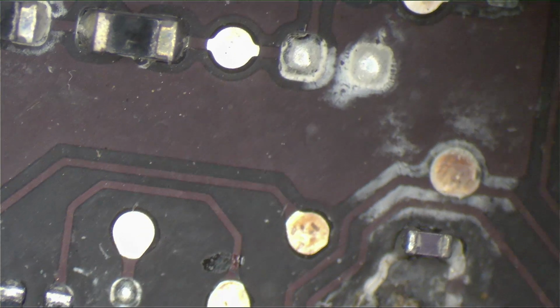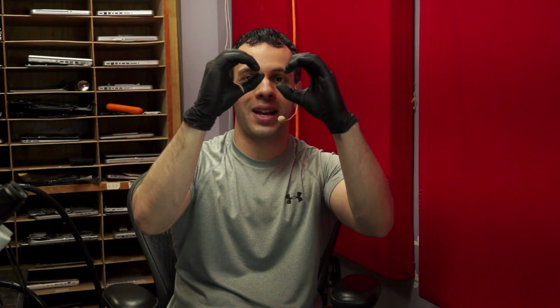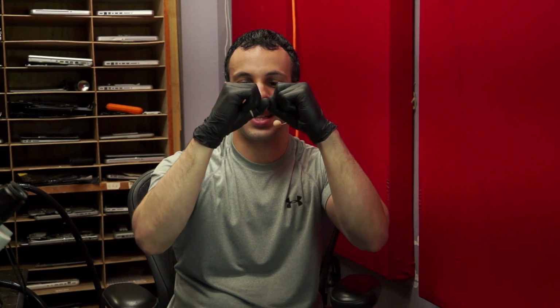And with microscopes like the SE400, which is a good entry-level microscope, when you change the lenses to go from 10x to 20x, it's almost like you're looking through a keyhole. A lot of people say, I don't know what you're talking about, and I would say that those people are blind. If you have an Amscope SE400 and you put on the 20x lenses, and you think that that's the same image quality that you're getting out of the 10x, I don't think you notice that at 10x you're looking out this, and at 20x it's like you're looking through this.